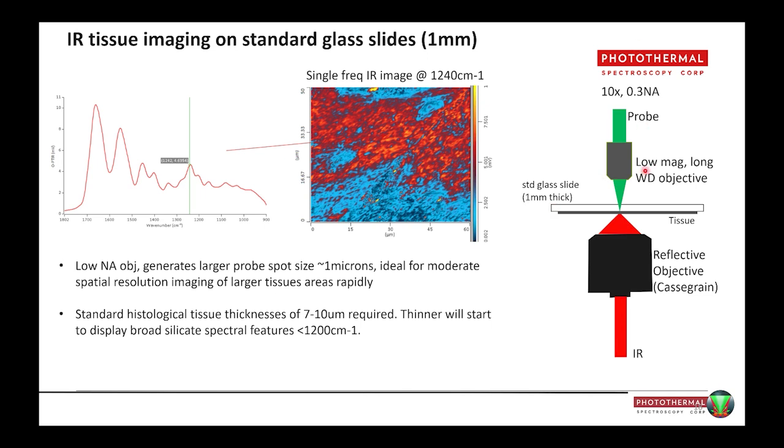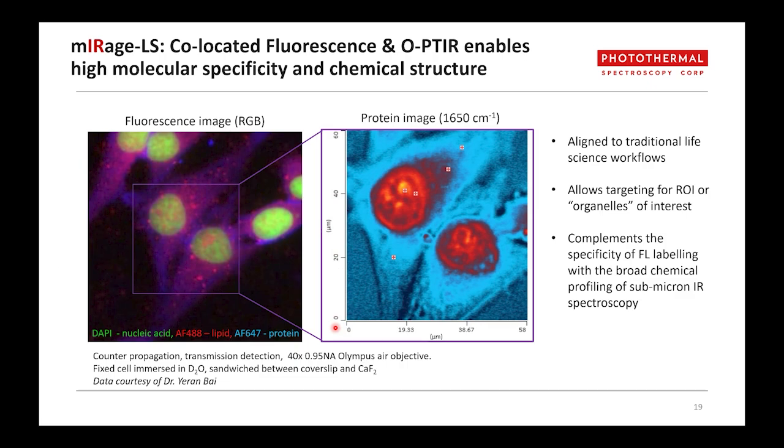Right, and in this case there is no subtle glass background there, because this is a tissue thickness that's in the order of sort of 7 to 10 microns, and at that sort of thickness, glass doesn't become a contributing factor at all.